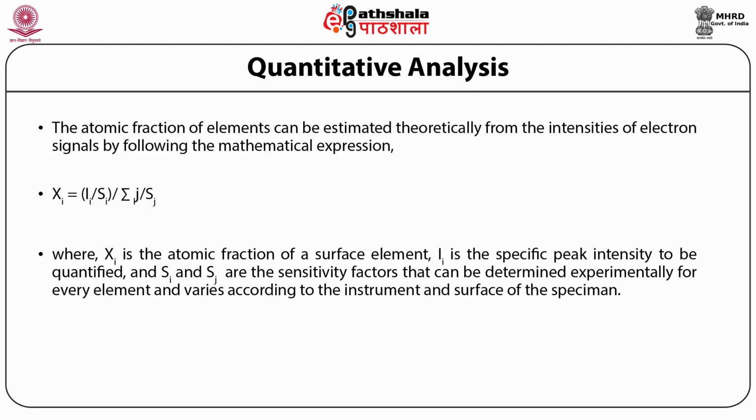As it is not feasible to compile a set of in-house sensitivity factors, the intensities of XPS peaks are evaluated from the peak areas after subtracting the background, and the chemical contamination on the surface of the sample affects the accuracy of equation 1.